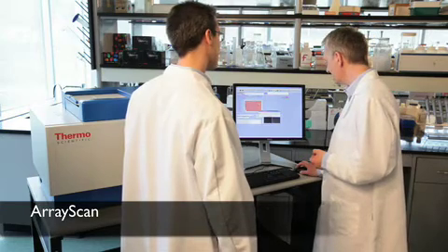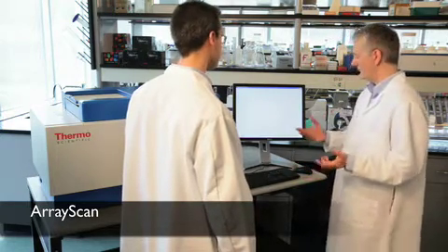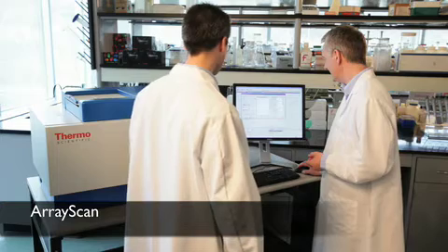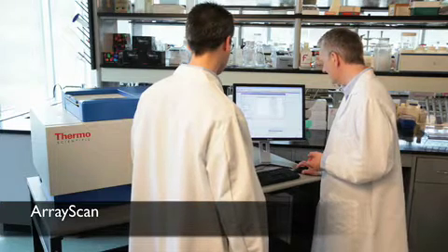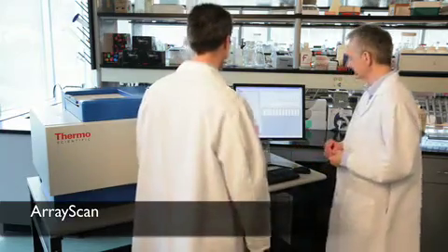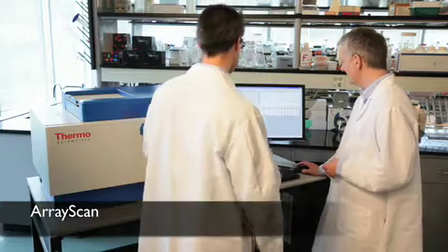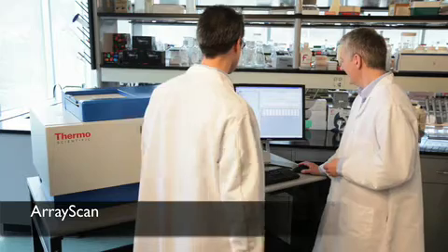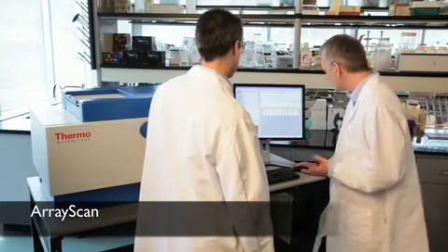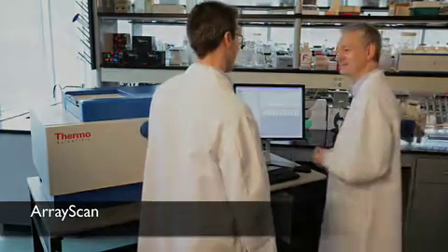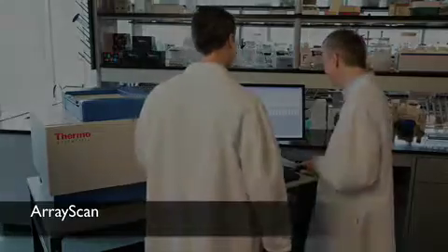So, like I mentioned, one of the nice features about this system is it does have a centralized informatics solution, so all the data is safely stored in the database. And we just logged in there. Here's all the measurements that we made. And, again. That's great. Oh, wow. The data looks good. My boss is not going to believe how fast I got these results. Honestly, now that I see how painless this is, it gives me an idea for so many other projects. Yeah, and I think, your data looks pretty nice. And, in fact, this instrument is booked a lot. So, hey, maybe you should think about getting your own instrument. That looks good. Yeah.